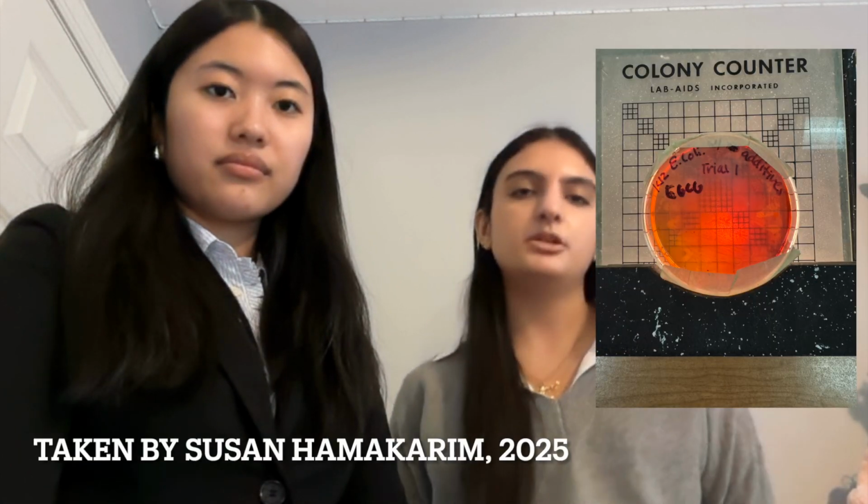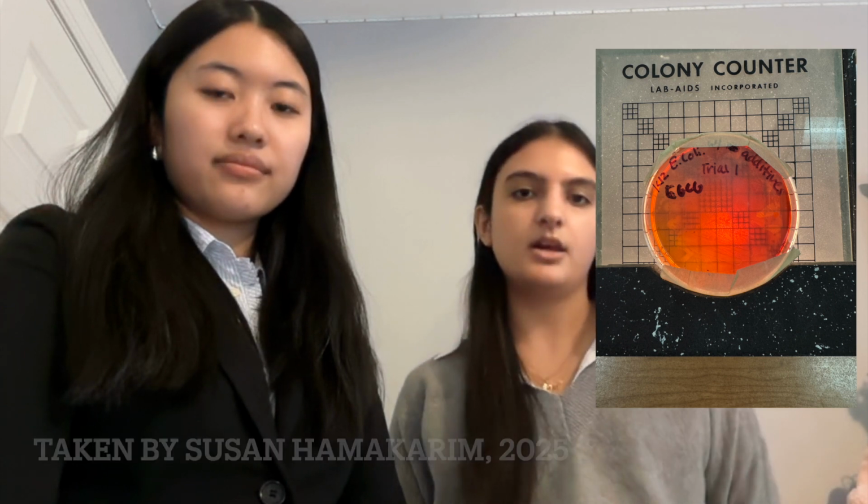We have 4 different scenarios. Group 1 was the addition of E. coli K12 colony with no additives, EGCG or hydrogen peroxide. Group 2 included the colony with the addition of 1 milliliter of EGCG but no hydrogen peroxide. Group 3 had an E. coli K12 colony with 0.5 milliliters of hydrogen peroxide but no EGCG. And Group 4 contained a colony with 1 milliliter of EGCG and 0.5 milliliters of hydrogen peroxide.